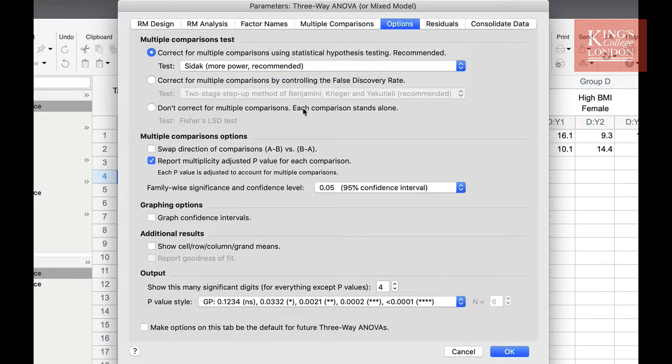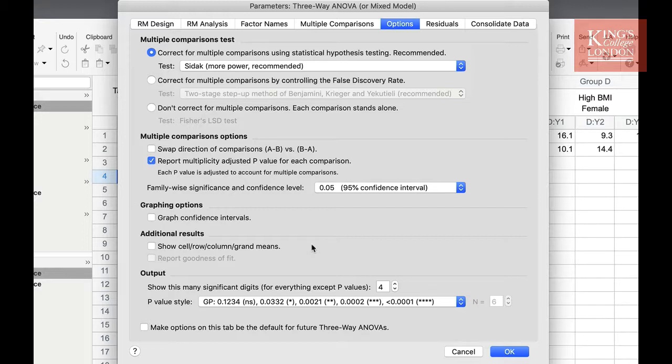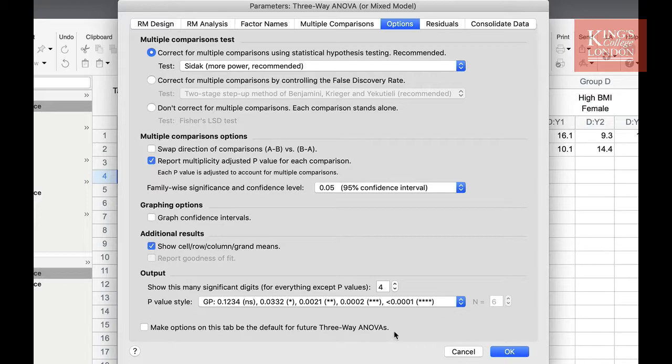Elsewhere on this tab, you can choose how the multiple comparisons are done, whether we plot a graph of confidence intervals, or show the cell, row, column, and grand means. For this demonstration, I will show these means. Underneath here, you can choose how your p-values are outputted. Once you have made these decisions, you can choose whether to create a graph of residuals.